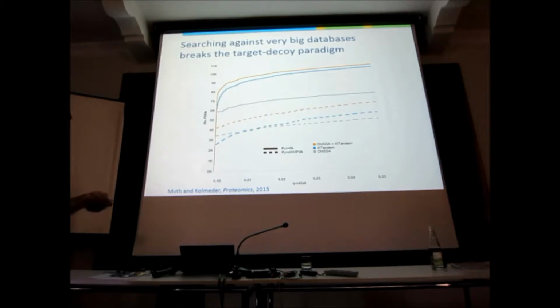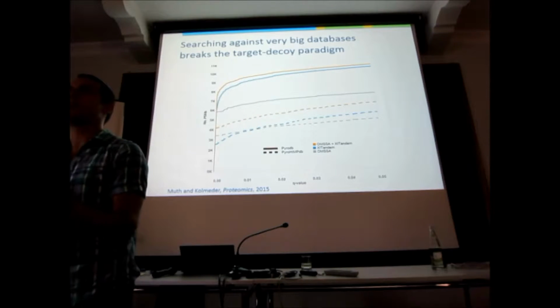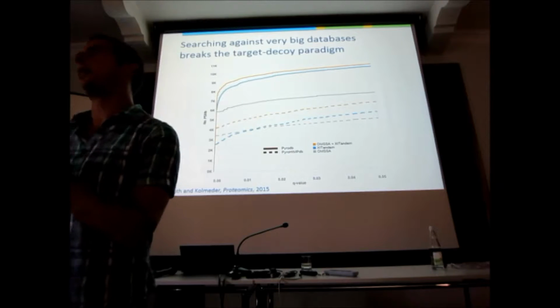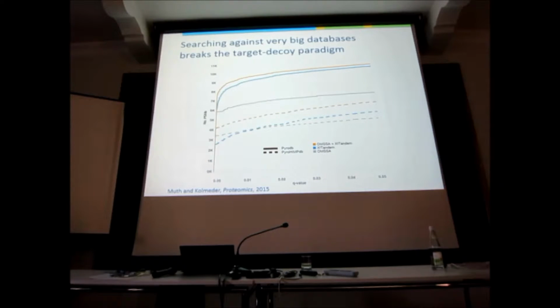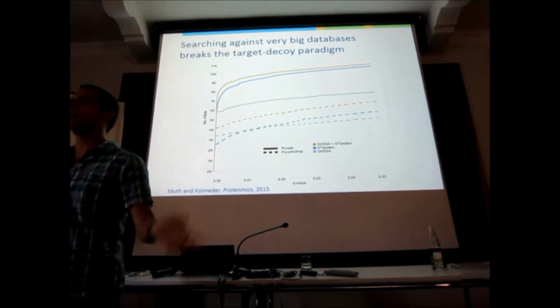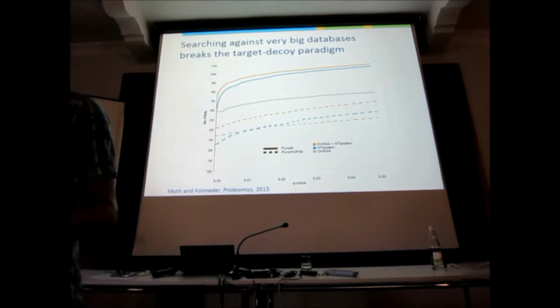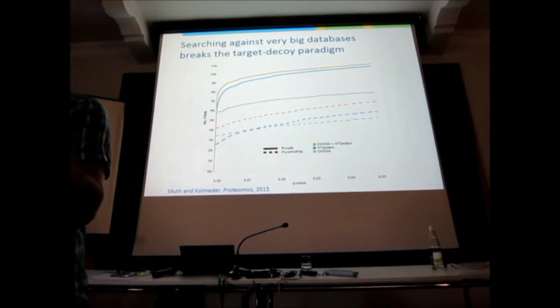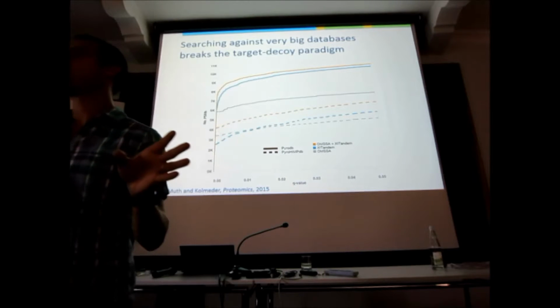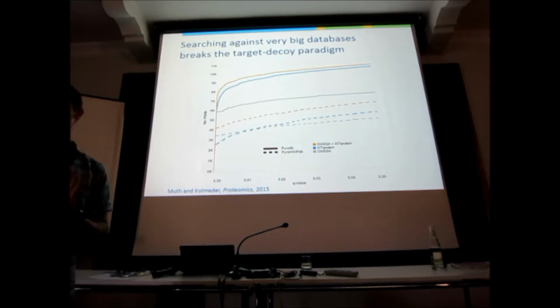Now, you see these dotted lines here, they're a new database. So, still Pyrococcus spectra. Now we search them against the Pyrococcus database plus the human intestinal metaproteome database. It's based on next generation sequencing of human fecal samples. They took all of the open reading frames they could get from that and shoved them into a ginormous database full of bacterial sequences. And these bacteria look very different from Pyrococcus. I would hope your intestines are not 100 degrees centigrade, even if you ate the chili pepper.